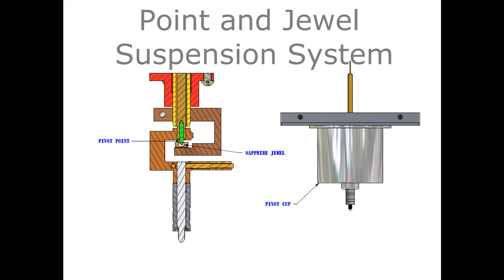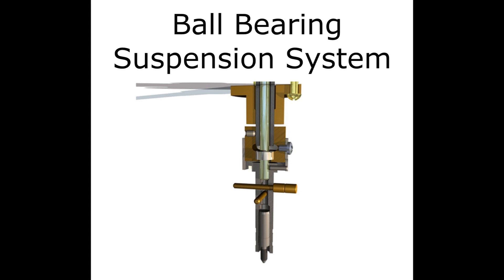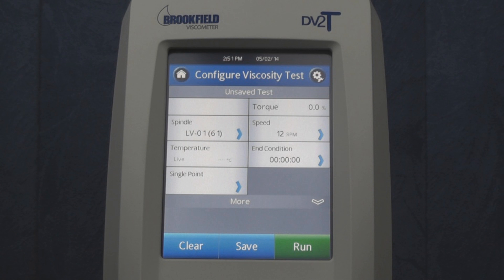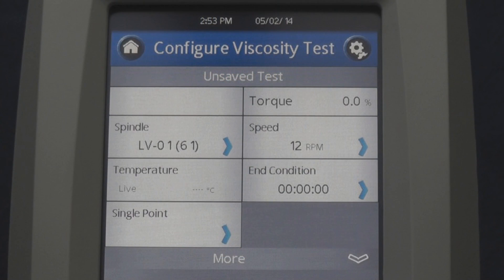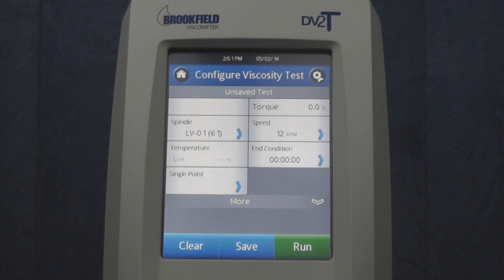An oscillation check is a quick and easy way to test the lower bearing of your instrument. This bearing must perform correctly for proper operation of the unit. This test is performed after the instrument has been auto-zeroed and ensures that the instrument, with no spindles or accessories attached, will rest at the 0.0% torque mark. The viscometer will use this 0% torque as a reference for all of its measurements, so if it does not initially read 0%, then your viscosity readings will not be accurate.